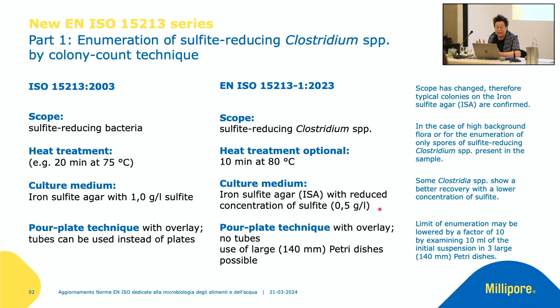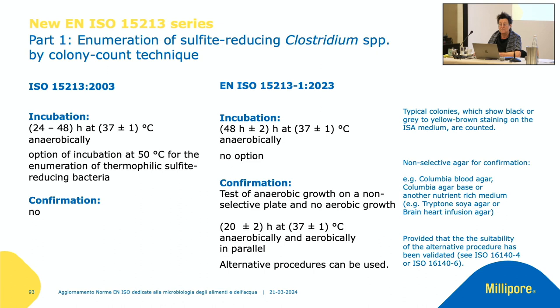Still, it is used by pour plate technique. Of course, no tubes are described in the new standard because the evaluation of the tubes was not easy. But we also described in the new standard the use of large petri dishes, 140 millimeters, which can be used with 10 milliliter sample or dilution. So you have a lower limit of detection, which was also a request of user labs. Incubation is now clearly defined with 48 hours, of course anaerobically, no specific options, clear direction.